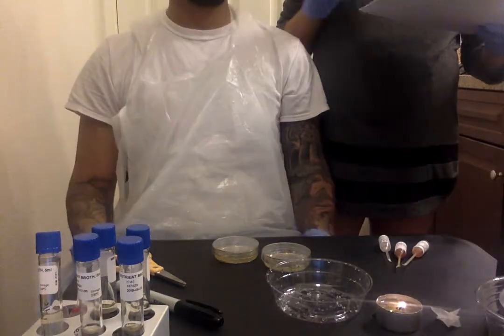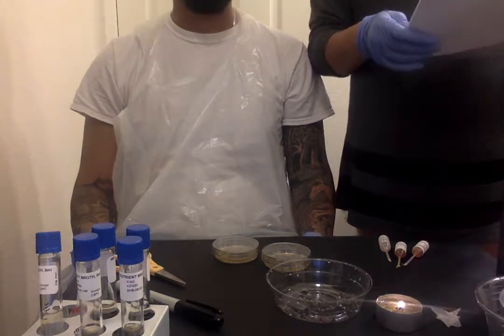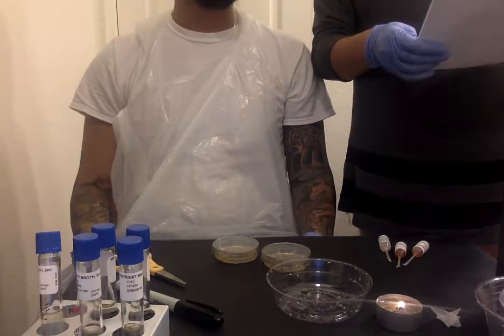Hello, my name is Aubrey Keenan. This is my husband, Adam Campos. He's going to be helping me with experiment biochemical testing for microbiome identification.